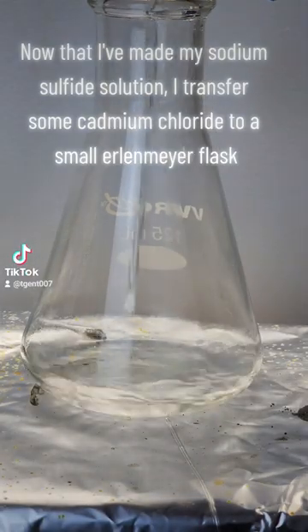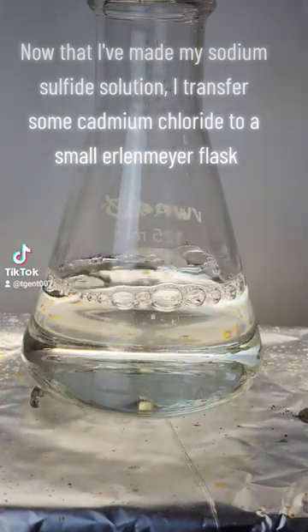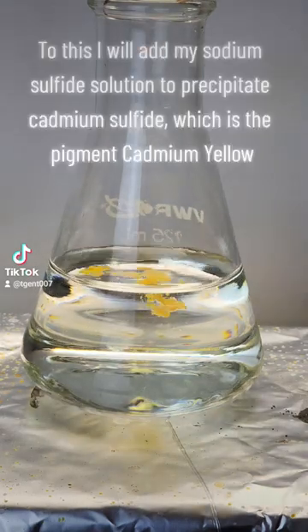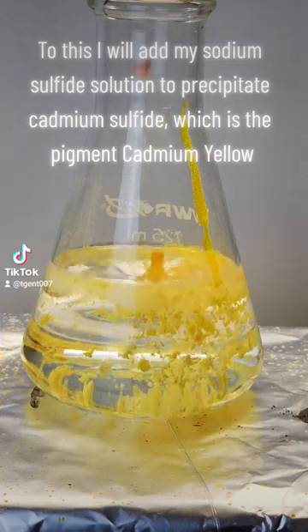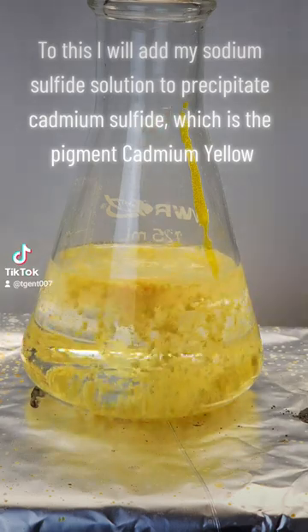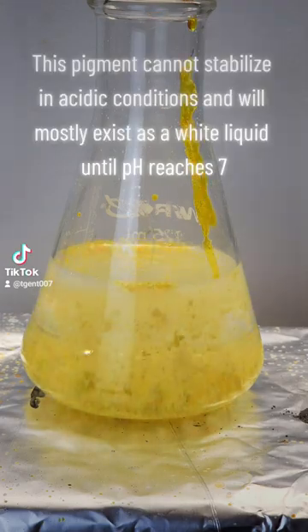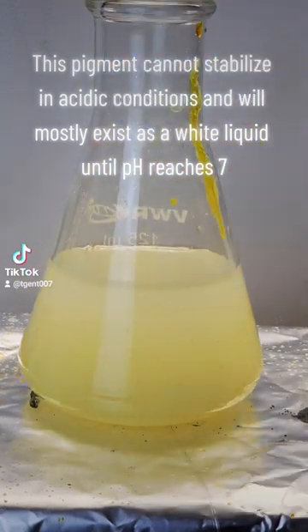Now that I've made my sodium sulfide solution, I transfer some cadmium chloride to a small Erlenmeyer flask. To this, I will add my sodium sulfide solution to precipitate cadmium sulfide, which is the pigment cadmium yellow. This pigment cannot stabilize in acidic conditions and will mostly exist as a white liquid until pH reaches 7.